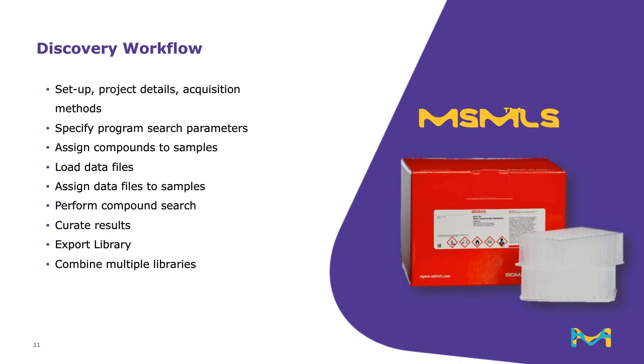So the remainder of the presentation will focus on the Discovery workflow, namely setting up the project, assigning search parameters, assigning compounds to samples, and then loading the respective MS data files. And then once this is completed, the compound search can be performed, and then the results reviewed and curated, and then finally the library will be ready for export. And if multiple libraries are made using different acquisition methods, these can all be combined to form one larger library.